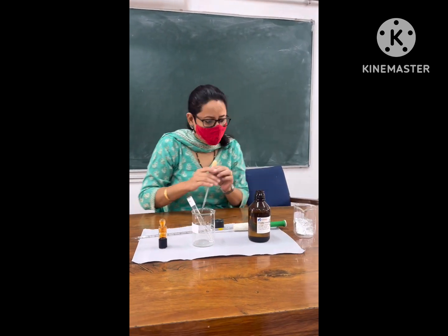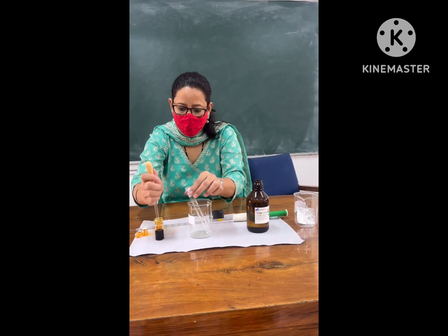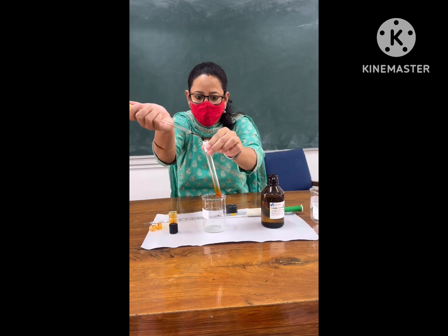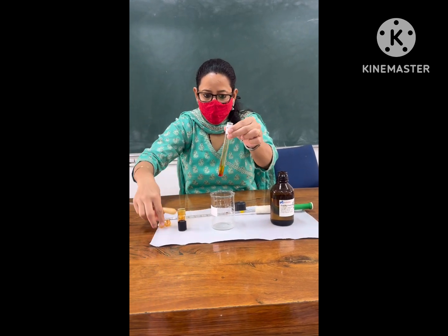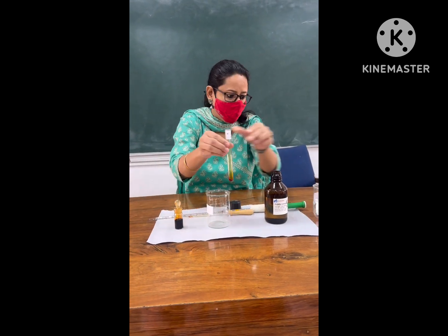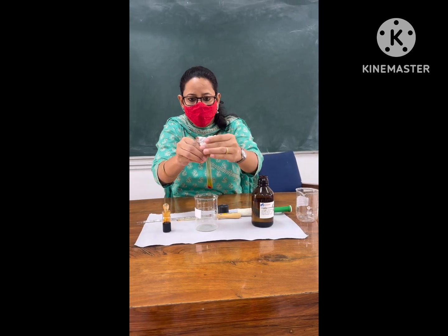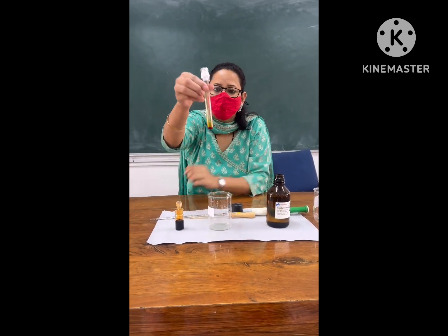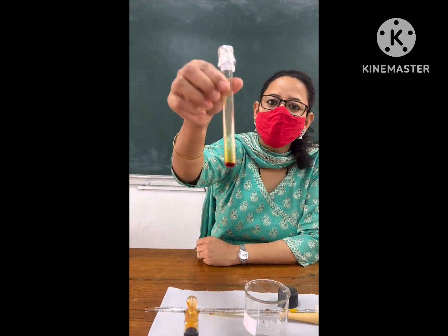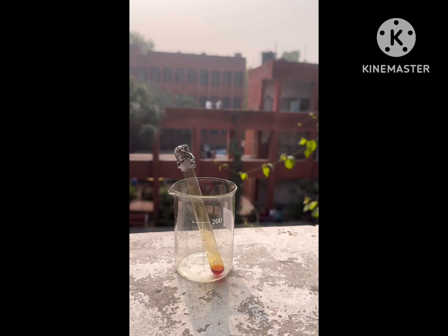To this, bromine solution is added drop-wise till we get a permanent orange color. Now this test tube or boiling tube is covered with an aluminum foil as you can see. So our reaction is ready.